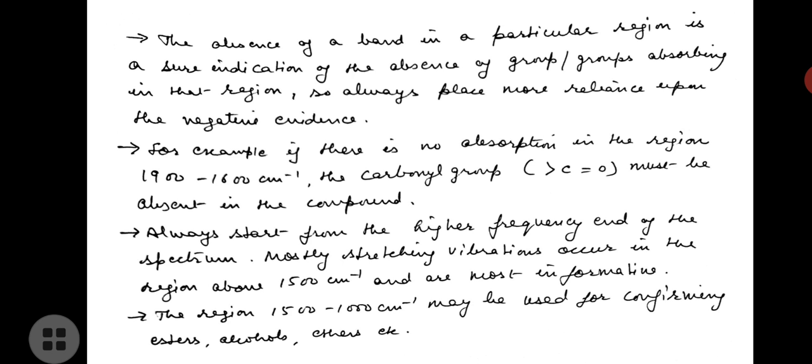Next is, always start from the higher frequency end of the spectrum. Mostly stretching vibrations occur in the region above 1500 cm⁻¹ and are most informative.